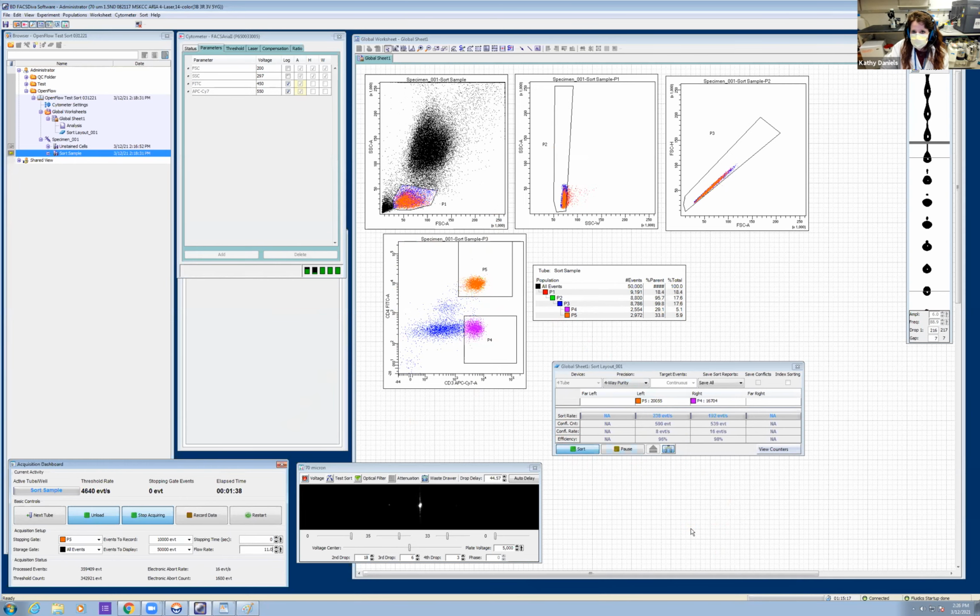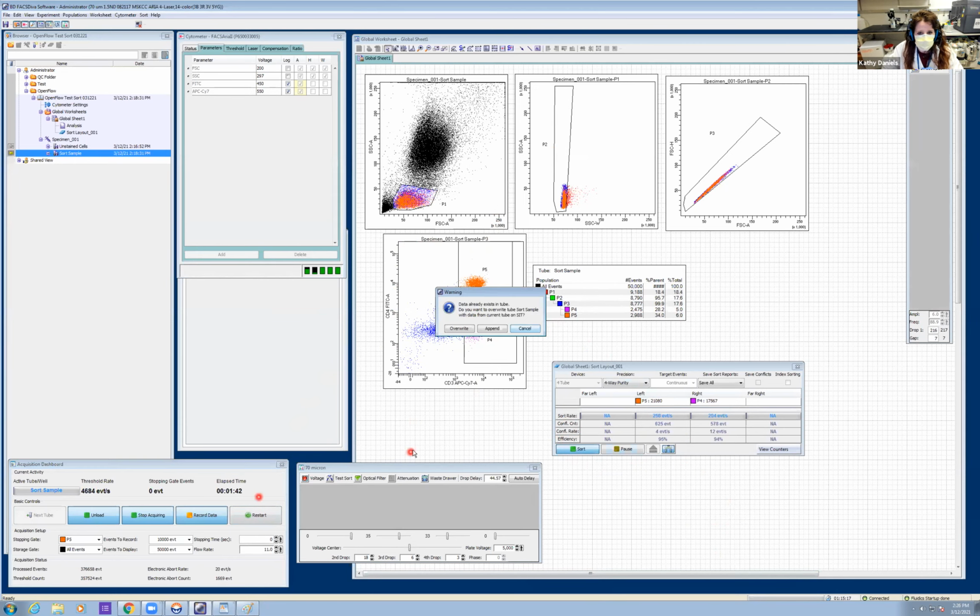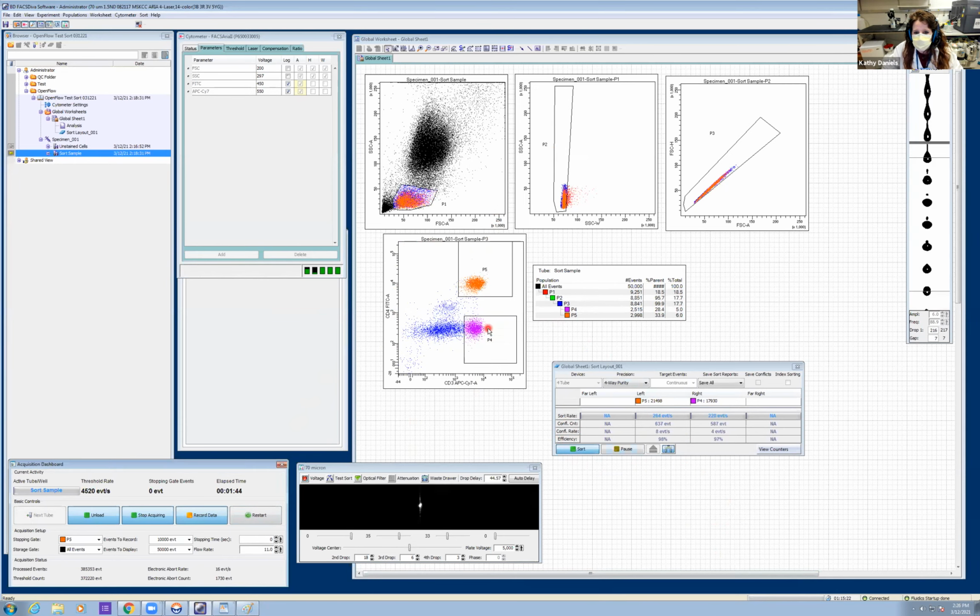So with that, I will go ahead and also start recording a bit more and append to that file as I pass it back to Derek. Okay.